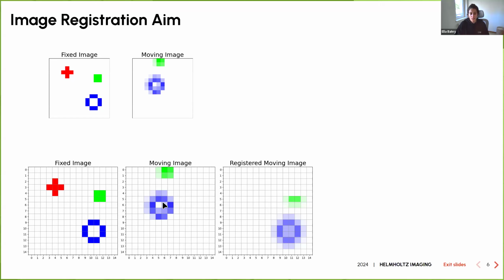And you can see here that the information in the moving and the registered images doesn't look exactly the same in pixel intensity. This is because of image interpolation and its needs. When we moved the sample, it didn't fall perfectly on an integer location of the pixel, and we need to account for it with pixel value interpolation, and we're going to see it soon.